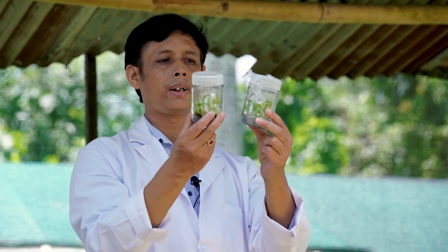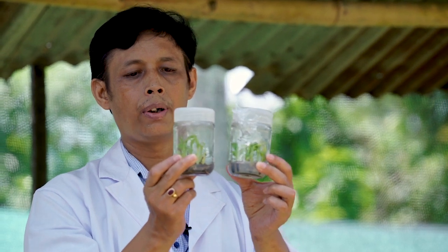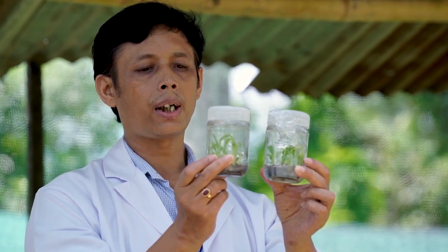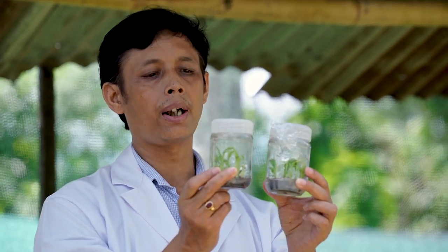Now, as you can see here, these are well developed banana microplants which have been grown within the tissue culture lab. Now these plants are ready for the hardening process. The hardening process is carried out in 2 phases. One is primary hardening and another is secondary hardening.